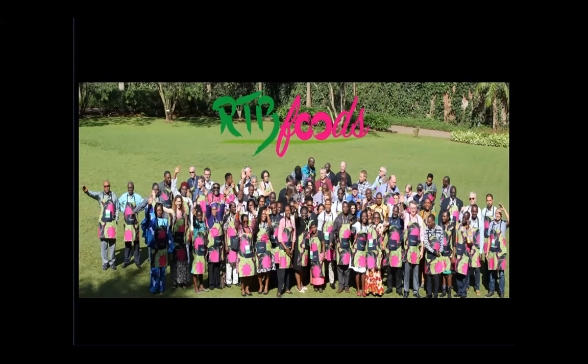But how many samples can you evaluate per day? Can you evaluate about 30, or 20, or 10, or 5? For the whole day. I can evaluate a lot of samples with HSI. I can acquire image after image, no problem.